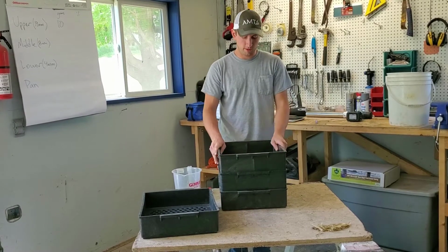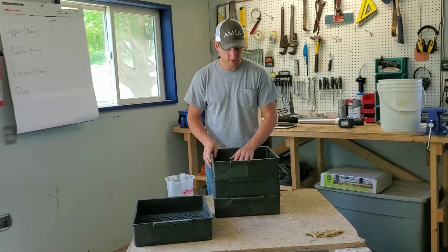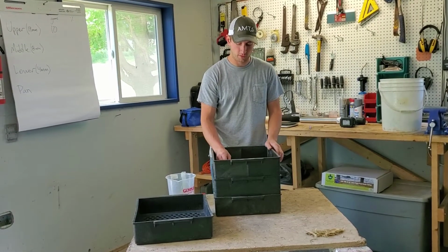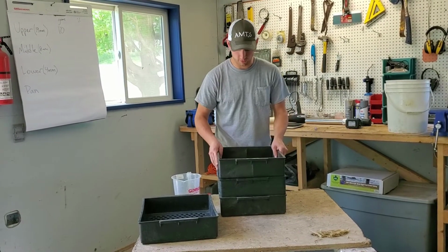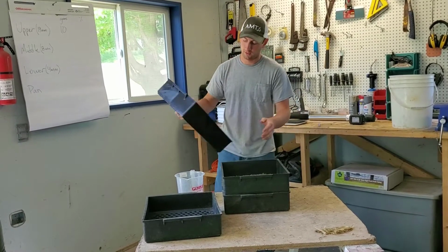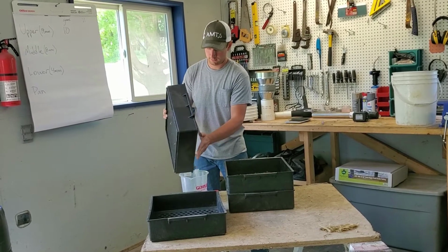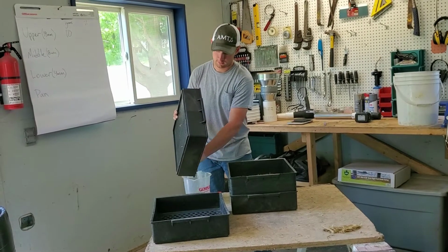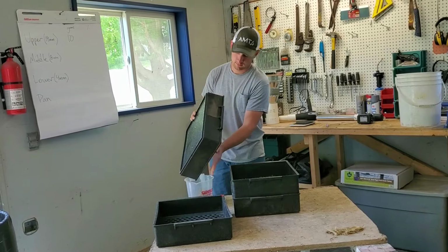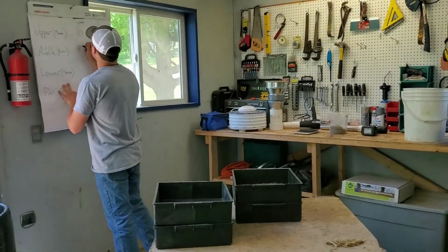Next up is the 8 millimeter sieve. Here is a good place to start looking for any kernels that you may see, in case you have a poorly processed corn silage. This one I do see a few little kernels here, so that's something I might want to discount, but I don't see very many. So for now I'm just going to keep moving. 96 grams.